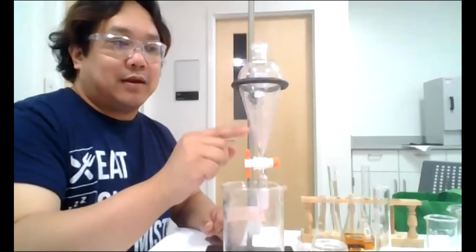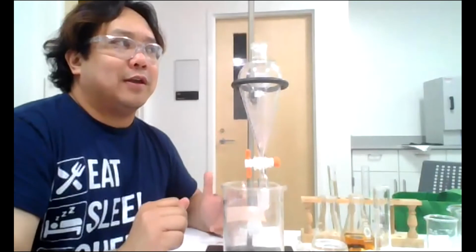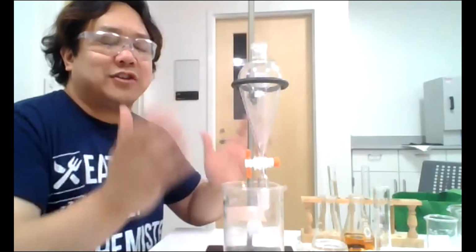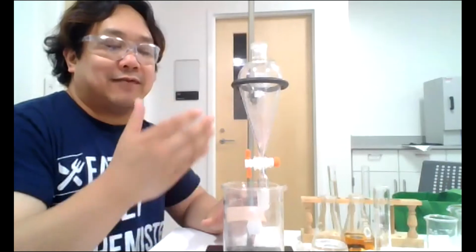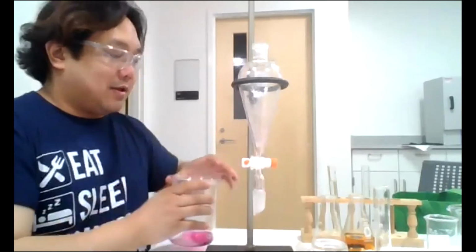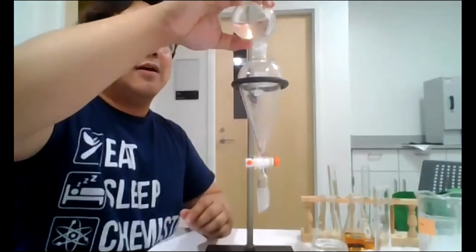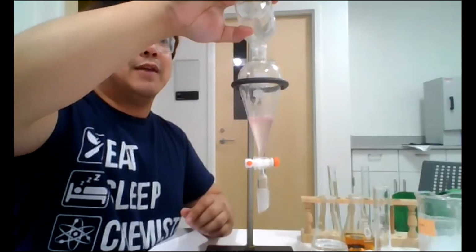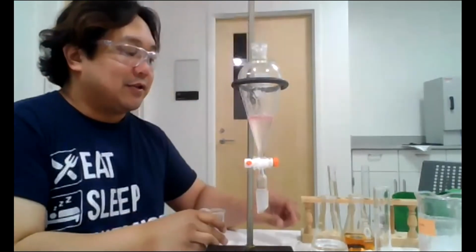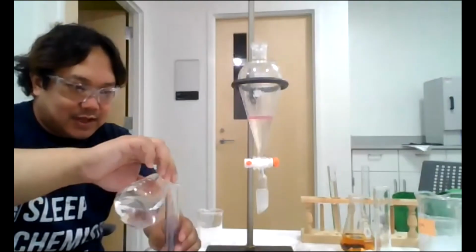Now I know it's a little bit nasty here. That's perfectly fine. You don't totally clean your washing machine after every rinse cycle. Using the same analogy, we're going to put back the laundry. That's now a little bit cleaner, but I could do another rinse to make it even more clean. So what's the other rinse? The other rinse is 10 milliliters of cyclohexane. There's 10 milliliters.